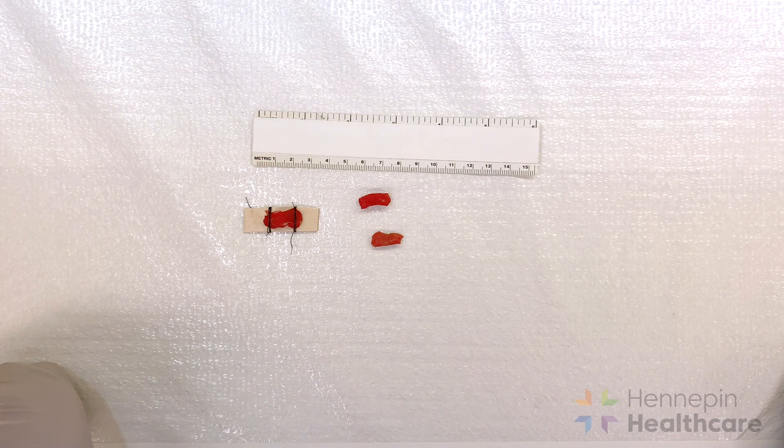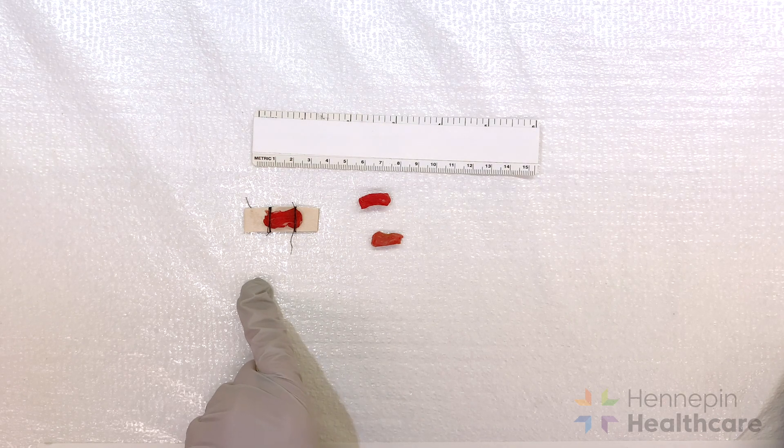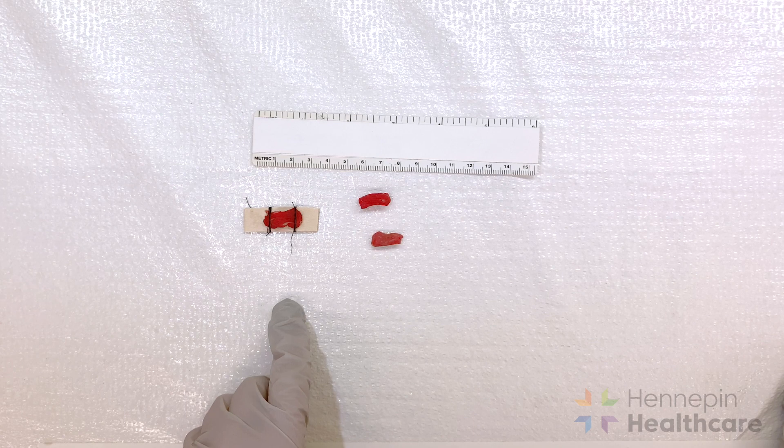Two of these pieces should be sent fresh and the third should be sent in EM fixative. If you only have two pieces, save the larger piece to be sent fresh.